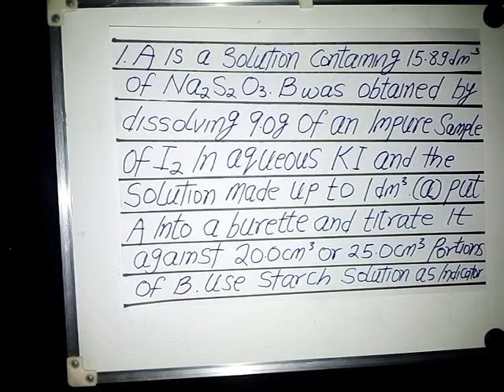So for the titration, we're going to look at this 2019 question. It is almost the same specimen that was brought. That is the titration between sodium thiosulfate and iodine. So that's why I chose this particular question to explain this titration. Take notes. This is just to guide you. I will also put out the table. We'll do some calculation, but the figures are made up, so that you can use them for your revision.